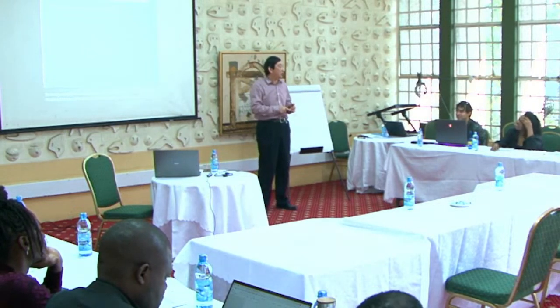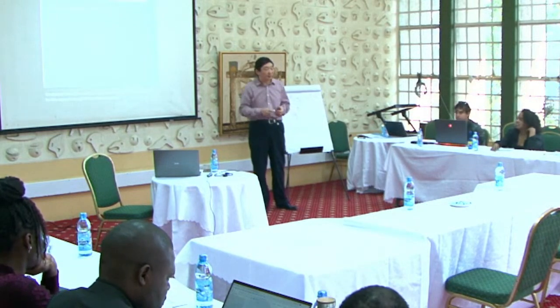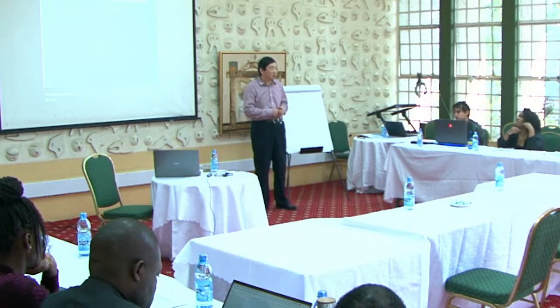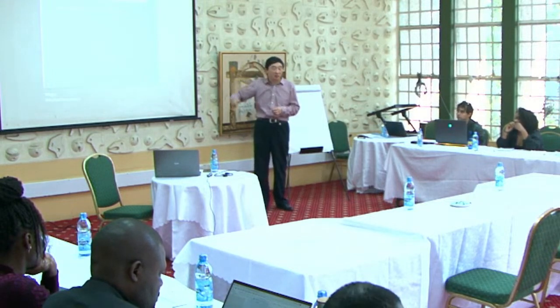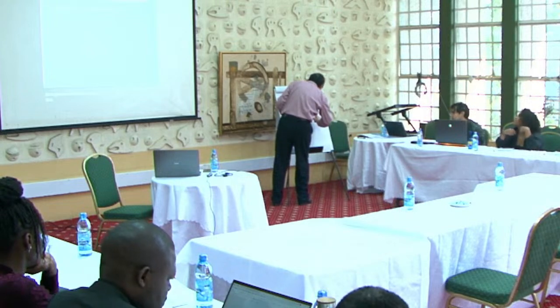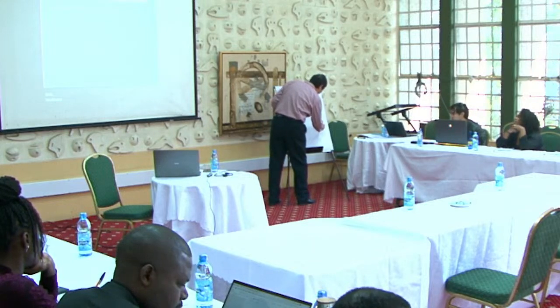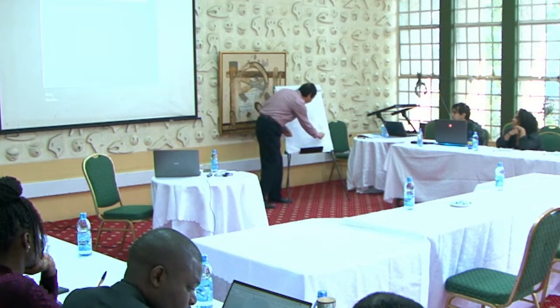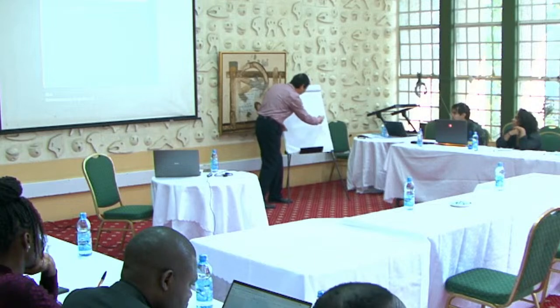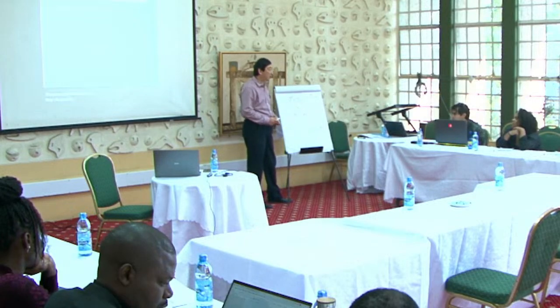So 43 is very common, right? Remember what's 43? Propyl, isopropyl. So it's just a 3 carbon chain. Then the 30 is the CH2NH2, then you have a propyl. The only question is whether this could be a branch here. Only one possibility. You do not have any other isomer, right?